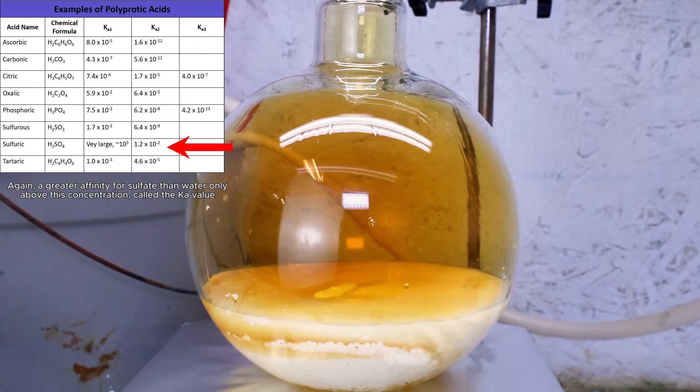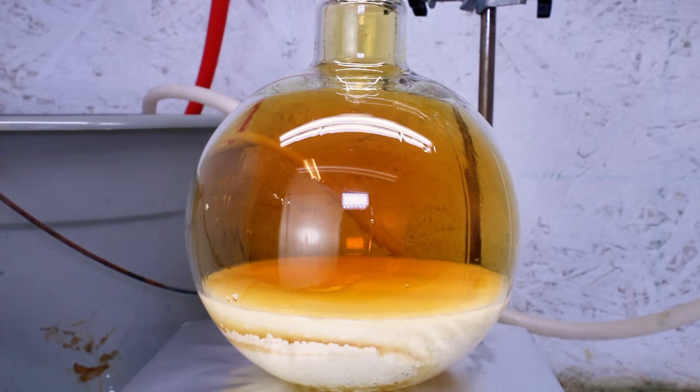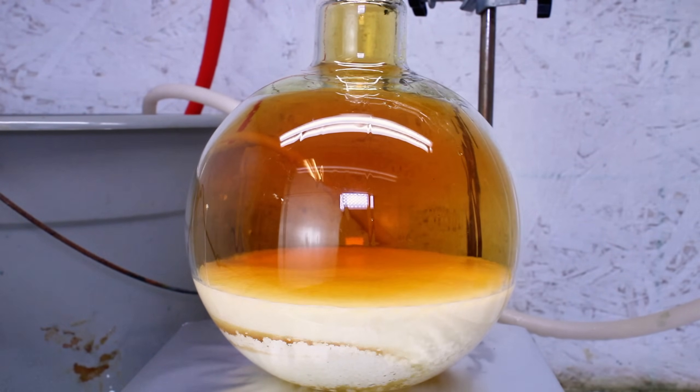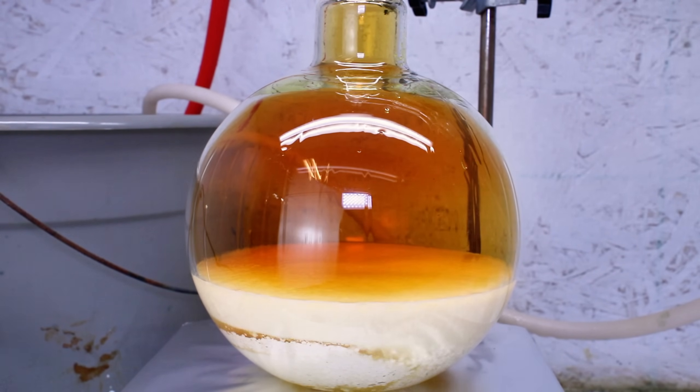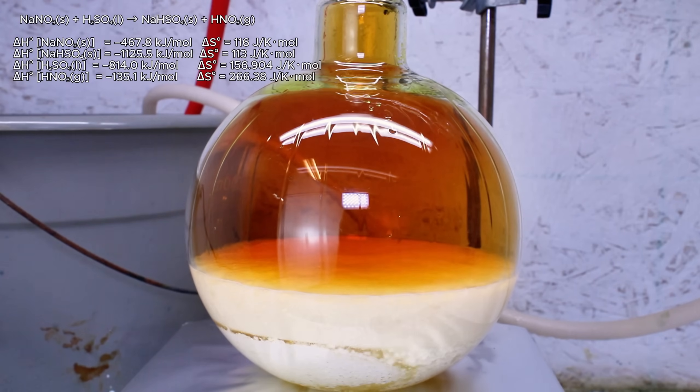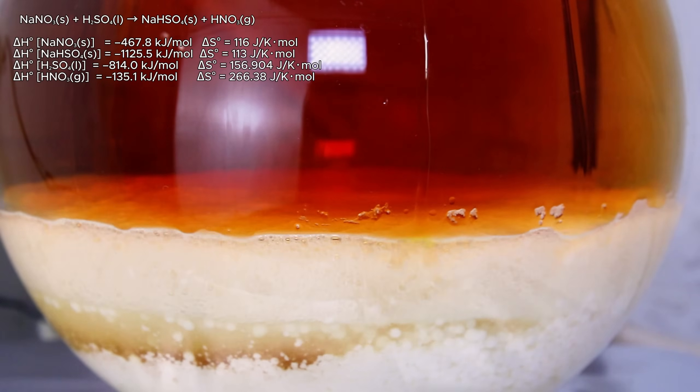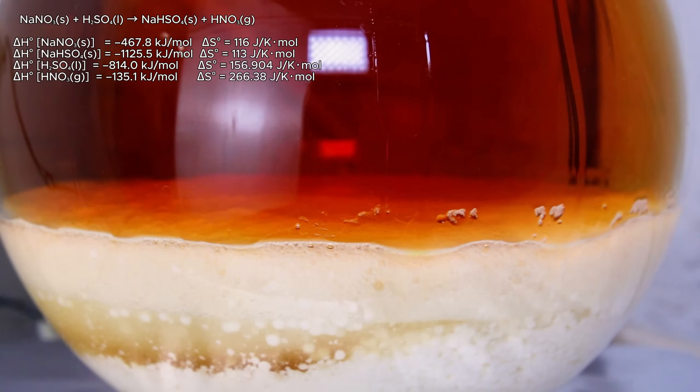Weak acids only give up some of their hydrogen in solution, and under normal conditions will only transiently form strong acids. As a result, the second possible reaction between sodium nitrate and sodium bisulfate is thermodynamically unfavorable. However, gaseous nitric acid is a higher entropy system than solid sodium nitrate, which makes this process entropically favorable.